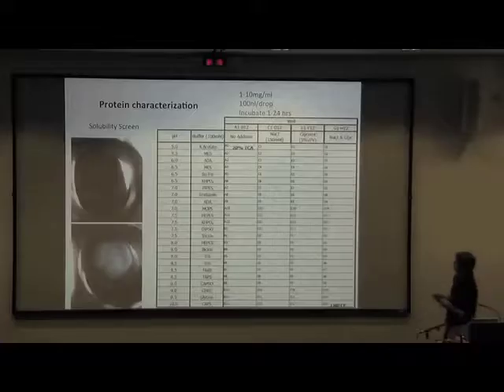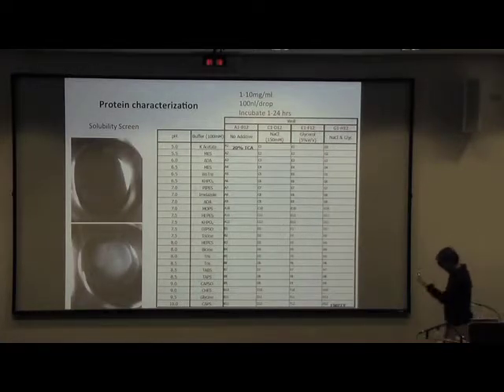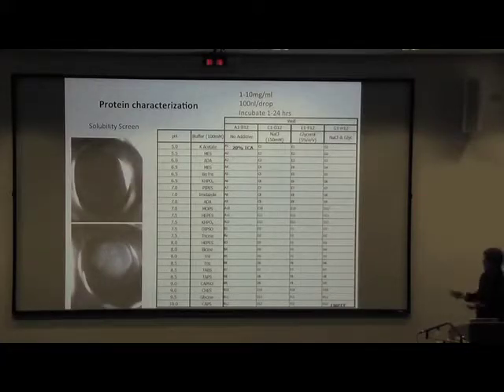And then finally, all right, let me move on. So this is a protein solubility screen that we developed, based on an earlier publication by, I don't recall her name, but it comes back later. Basically, she designed a way of testing 24 different buffers, looking for precipitation, and the ones that stay clear you examine by dynamic light scattering, and that way you can find a suitable buffer condition. The way they set it up is rather large scale and manual, so I changed it a little bit to a robotic setup.